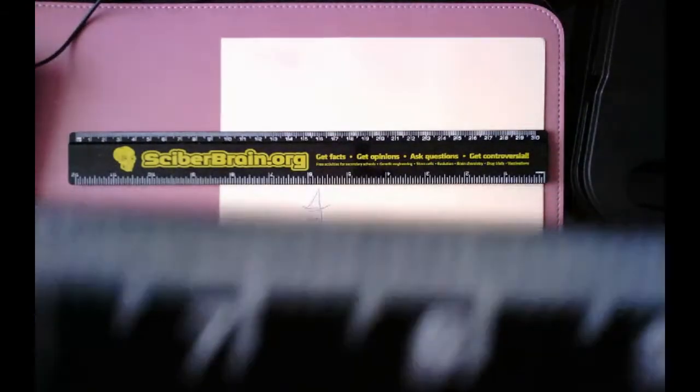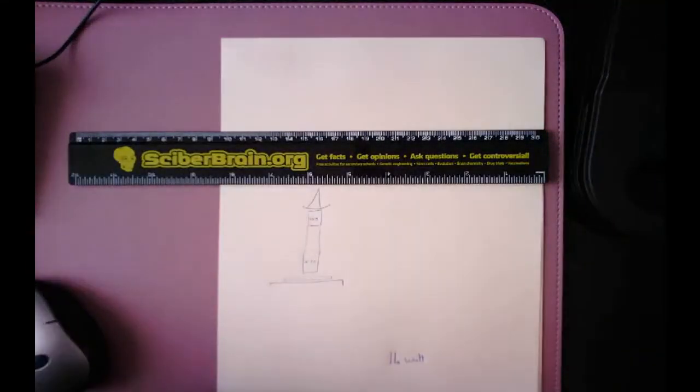And what actually happens is the eyepiece one can move around, the bottom doesn't, so I would try and line them up, and here, the 7 to 8 is the equivalent of going from 20 to 30.